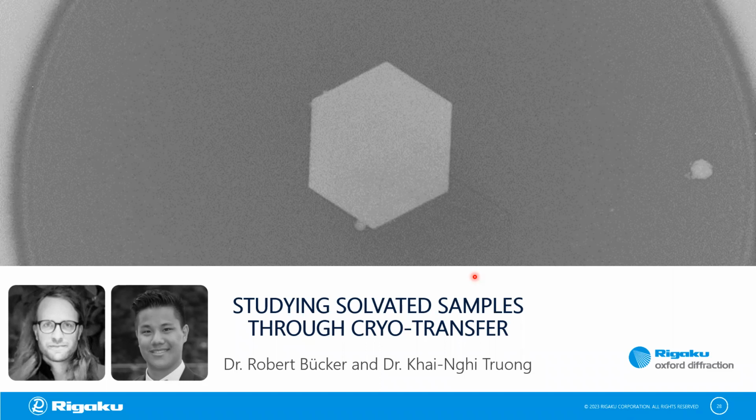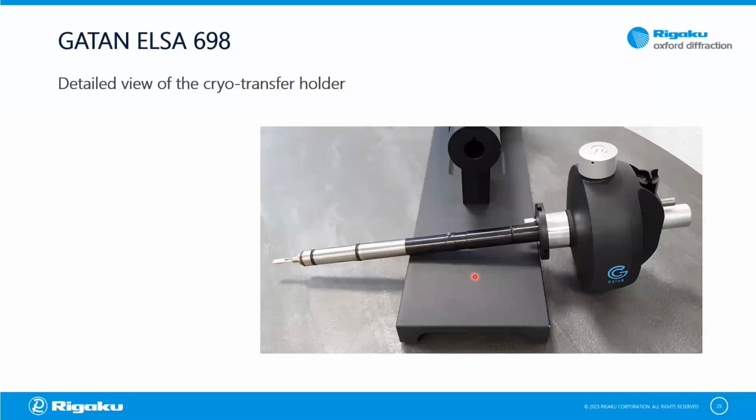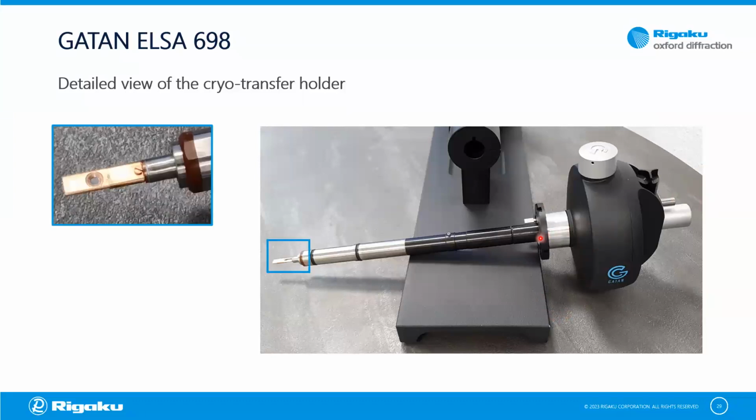So to do this, in our diffractometer, we have this advantage that we keep the samples on those sample arms. So instead of using this room temperature sample arm that we've seen in the video earlier, we can use a slightly different model, which differs in that it has this dewar mounted here, which is relatively small, but has a very long hold time. And this dewar is thermally connected through a rod in here to the tip of the holder, where, in a similar way to the room temperature holder, the sample grid with the powder on it is held using a simple retaining mechanism.